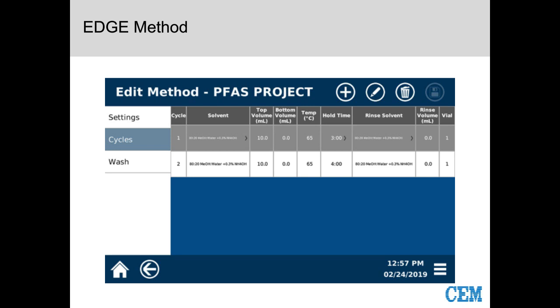And we used HPLC grade solvents for this study. So we did do a 2-cycle method. And if you remember back in the video, I talked about a bottom add and a rinse. But we're keeping this really basic and simple, and so we're actually going to just add for the top in these cases. So we're doing a 10 mil top add.